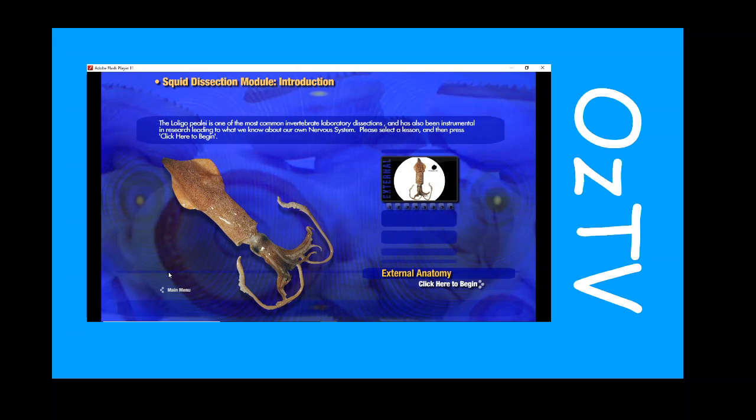The Loligo squid is one of the most common invertebrate laboratory dissections and has been instrumental in research leading to what we know about our own nervous system. Please select a lesson and then press click here to begin.